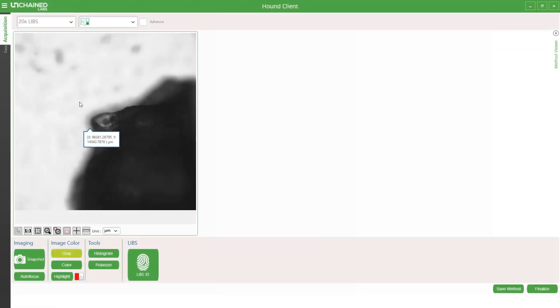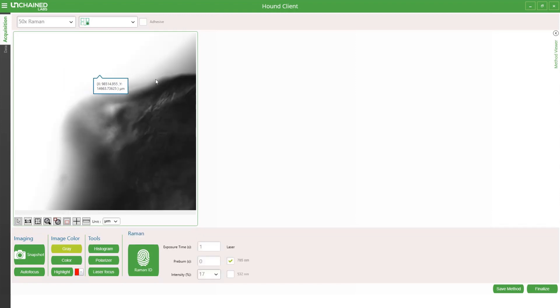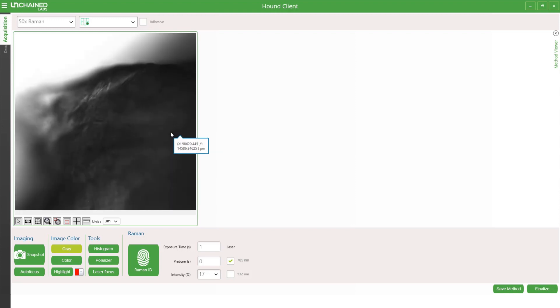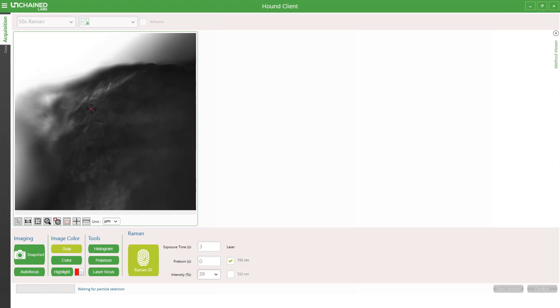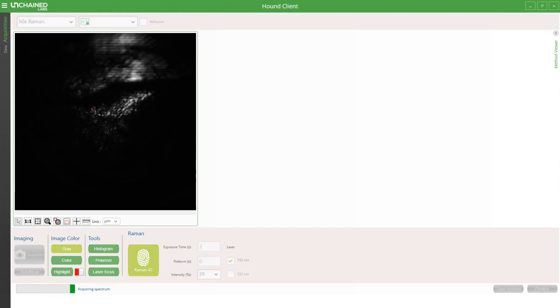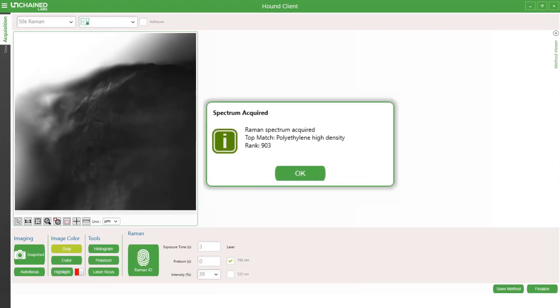Moving over to the next particle, I'm going to increase the magnification further and use the 785 nanometer Raman laser to try to identify it. I will start with low laser power and low exposure time to see if I can get a measurement. I get a match of high density polyethylene.